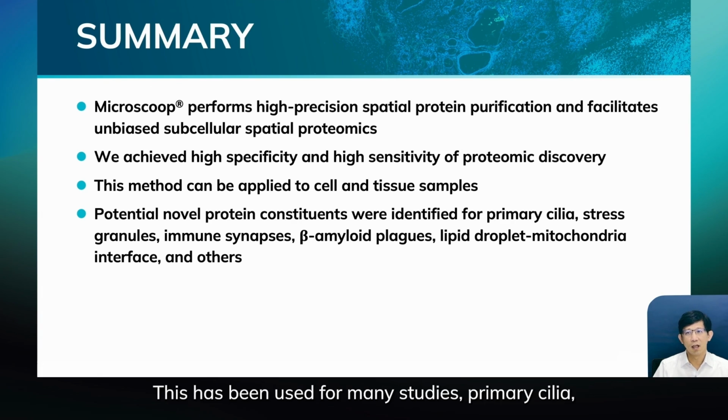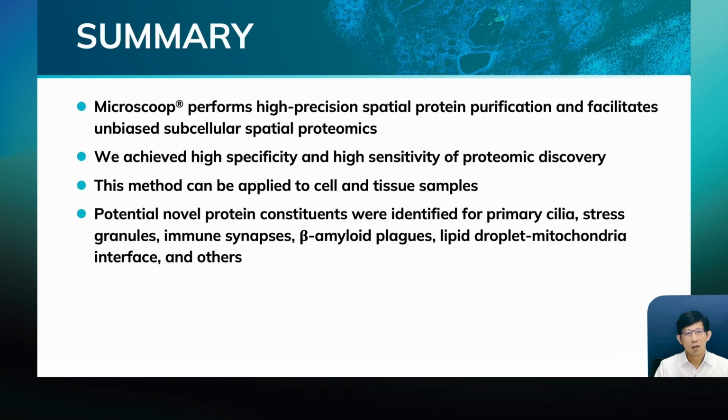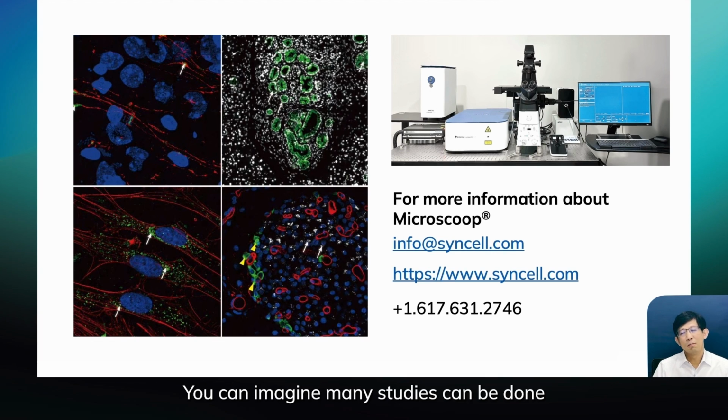We can do it. And this has been used for many studies, primary cilia, stress granules, or other problems I just showed. So you can imagine many studies can be done with image-based, image-guided proteomics, right? So now it has opened up a lot of opportunity for researchers in different fields.